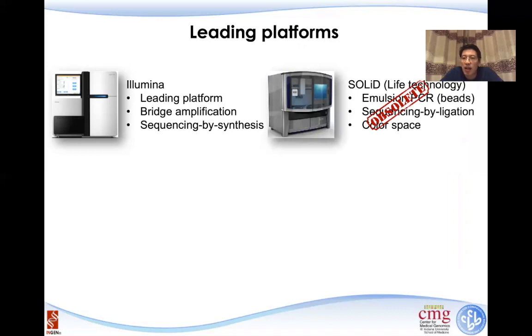The second technology I labeled here as obsolete, and which is a SOLiD technology. But I have to say that because it has been obsolete for the past couple of years, but we still have some data that is in the public domain as well as in the publications. So you just know that there is a sequencer available as SOLiD, but it's no longer available.